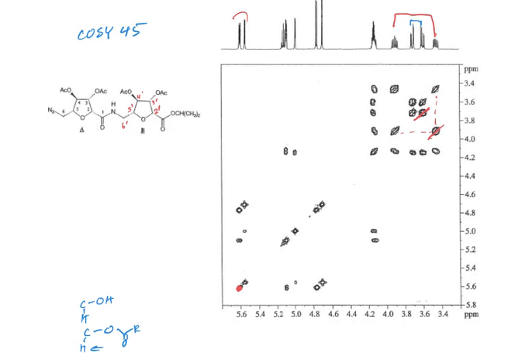6 prime is the more complicated one. This is a case where we have a proton on a heteroatom, but it's on an amide, and these exchange less, and so we're seeing some splitting from this amide to the H6 prime peaks. Okay?